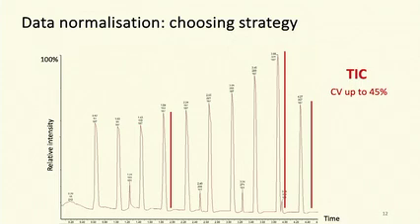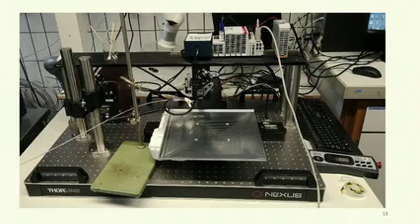I will give you some spoilers. It will be the total ion current, or a difference between the height of the peaks. Why does it happen? Because it's just the same sample. Those are replicates. Well, because our ablation station looks like this. It's open. It's open to ambient conditions, and every fluctuation within the room will affect the amount of vapor that is transported through the sample tube.